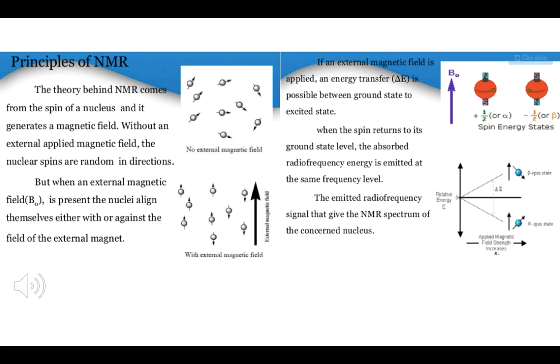So when we look at the first piece of information, we're looking at the number of signals. There are many signals on each spectrum that are unique, and we call them non-equivalent protons. Equivalent protons are defined as protons that have the same environment on the molecule. For now, let's assume that hydrogens bound to the same atom are considered equivalent.